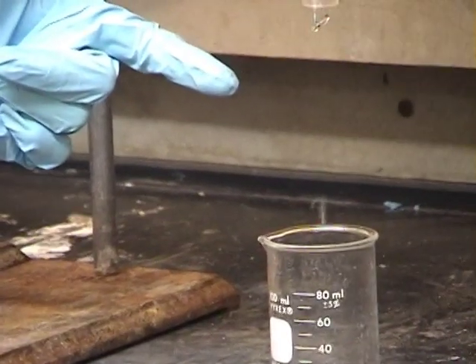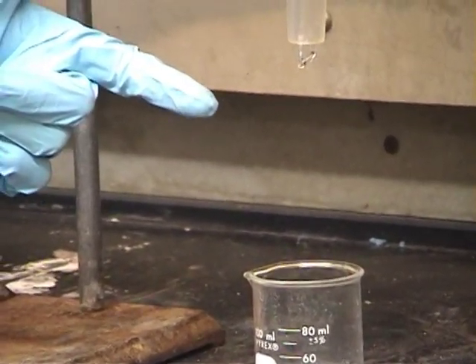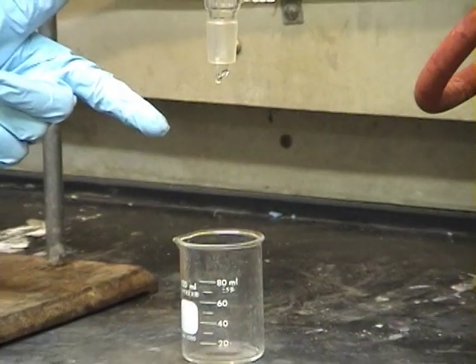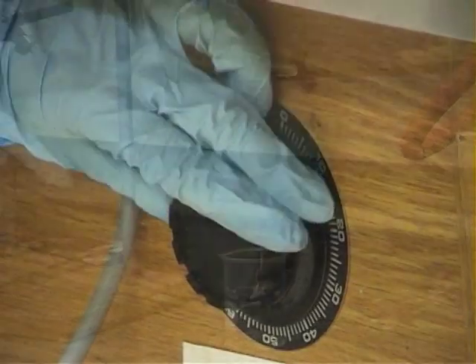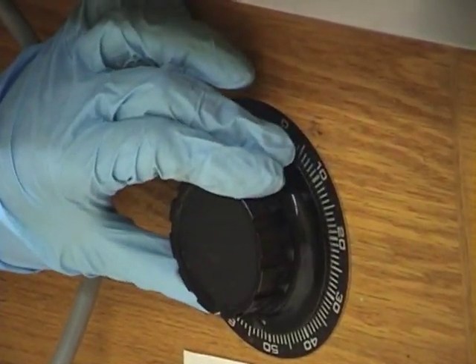The distillate should drop at a rate of one drop per second. If it is dripping faster than that, as shown here, the variac dial should be turned down.